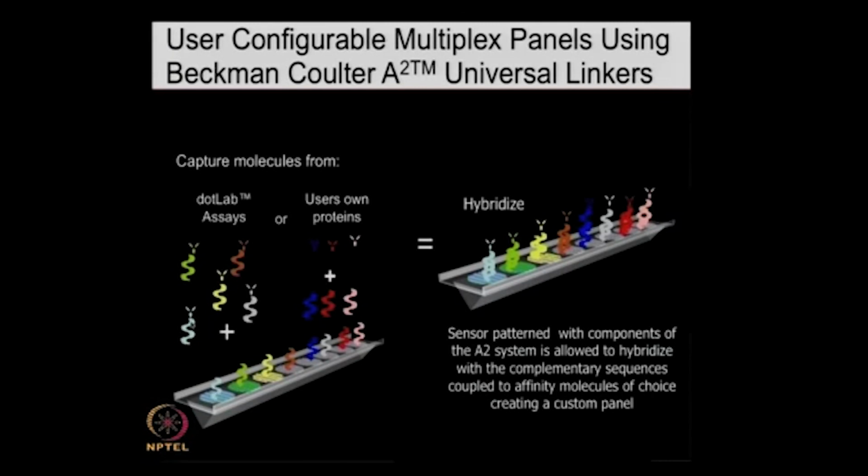So, for example, when I bind this dark blue single-stranded oligo to the protein, it will specifically bind to this site. It will hybridize to a specific location. You have to react your protein with this DNA, but that chemistry is known, and then you just inject them all and they go to the right locations.